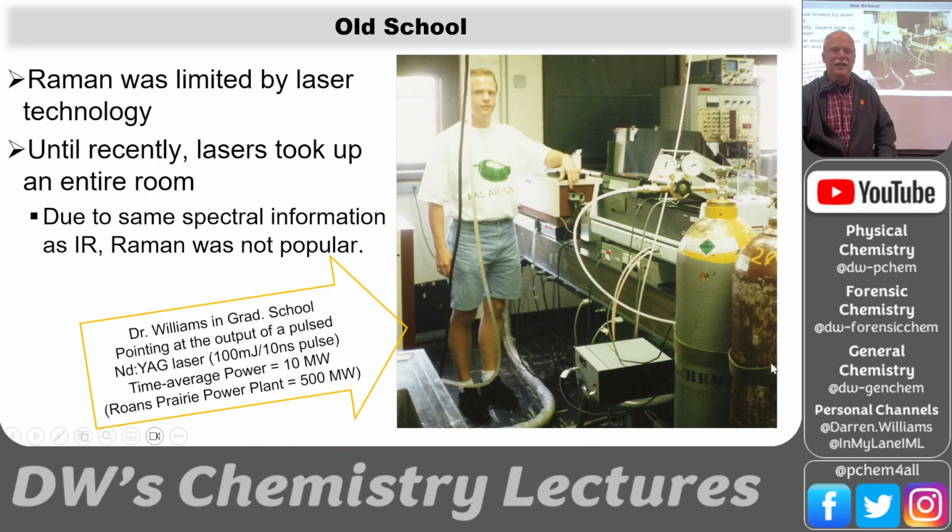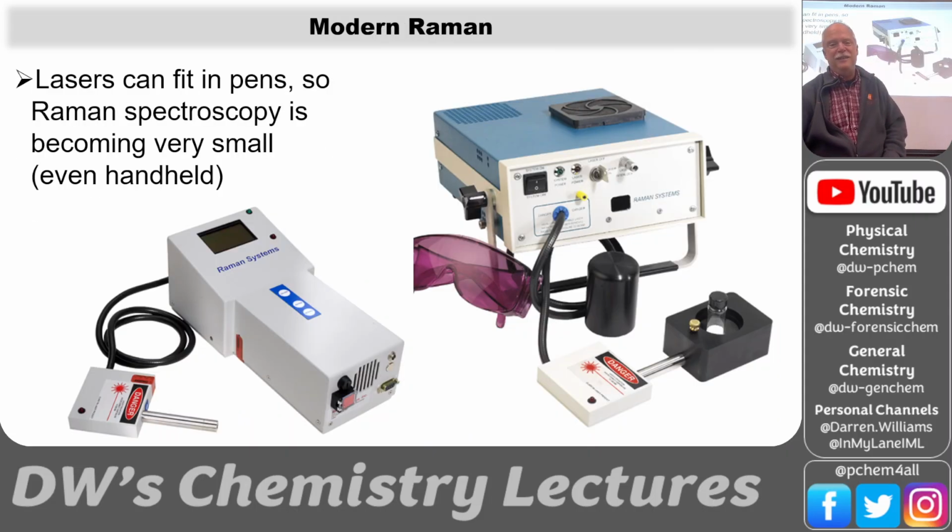And this is the Raman laser from my graduate school days. It was so powerful, it hit a fellow who was walking through our lab, and he didn't see the infrared beam. It hit him on the side. It looked like cigarette burns. Went through his shirt and burned his skin. So it was a pretty powerful laser. He starts screaming, ah! We're like, what are you doing in here? You shouldn't be in here. We have all the safety features disabled when he walked through.